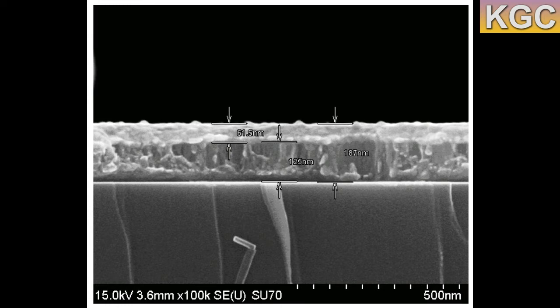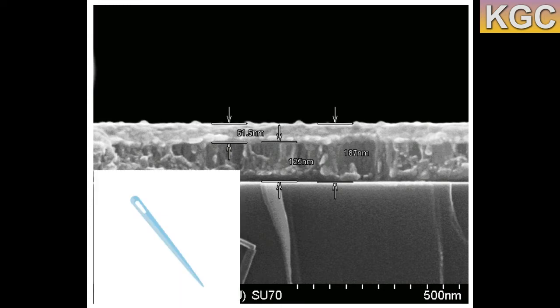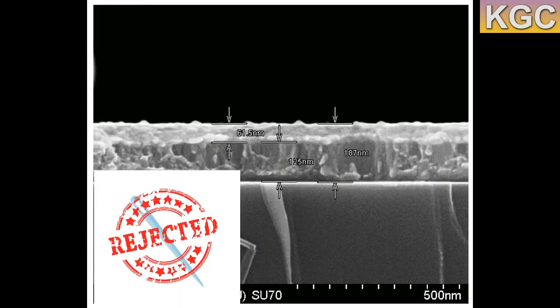However, during the measurements, only few nanometers thick film samples might be permanently damaged by sharp needles.